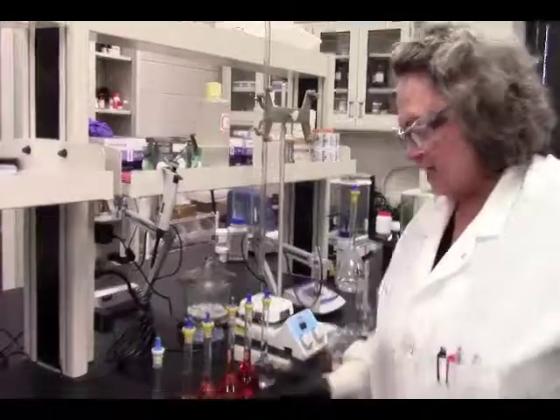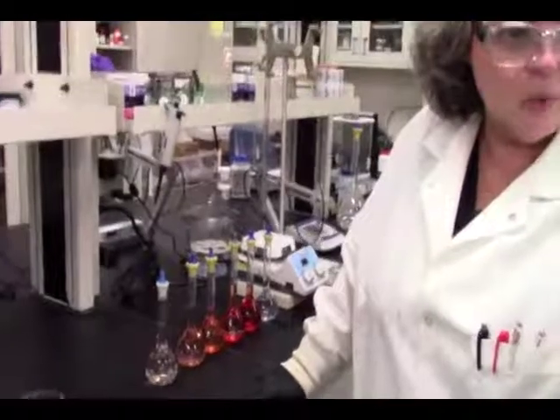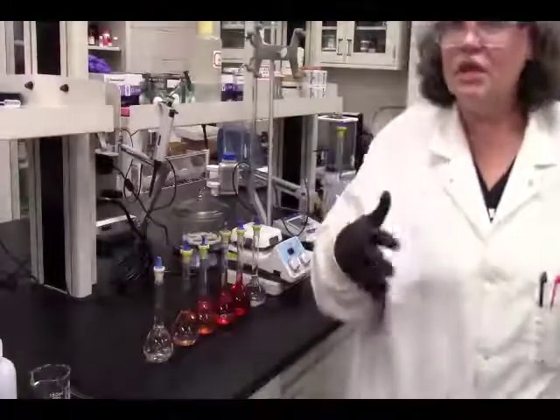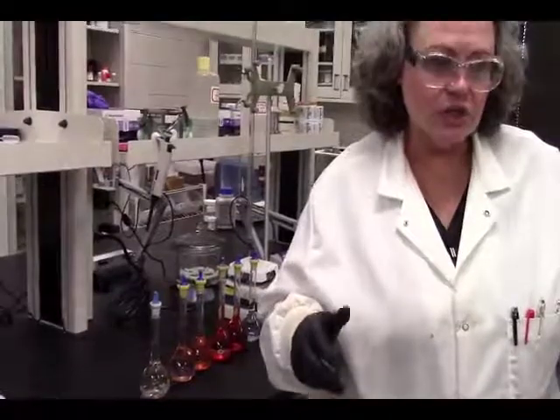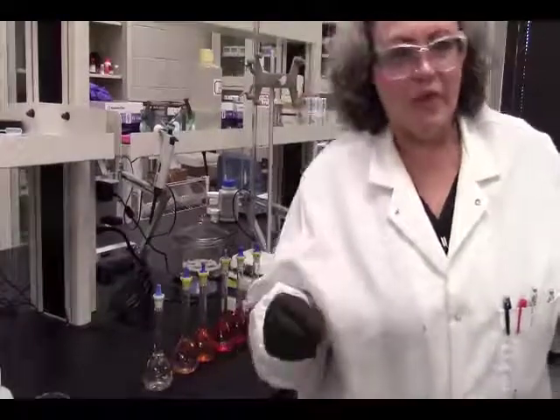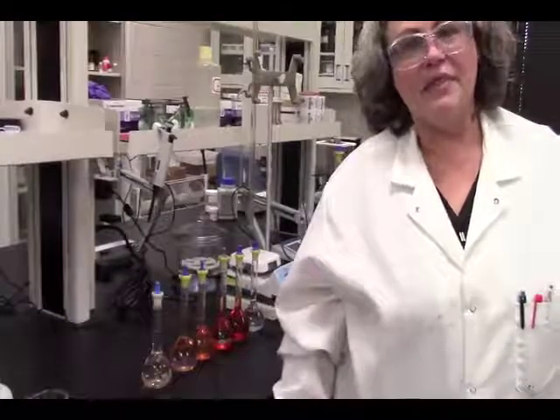Why do we need a standard curve? And then we have 3 unknowns. Why would we need 3 unknown solutions made in the exact same way? So you need to include that, explain that for your discussion conclusions, because now we're moving more conceptual rather than you being hands-on here for the technique and the method.